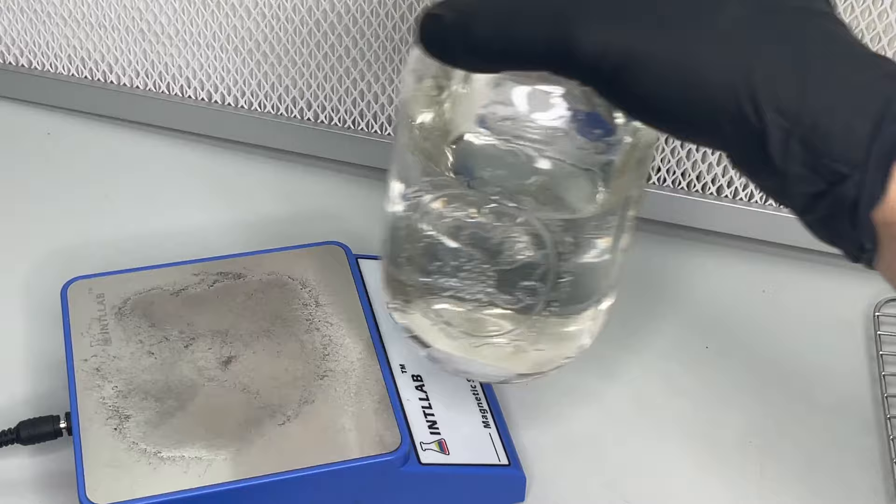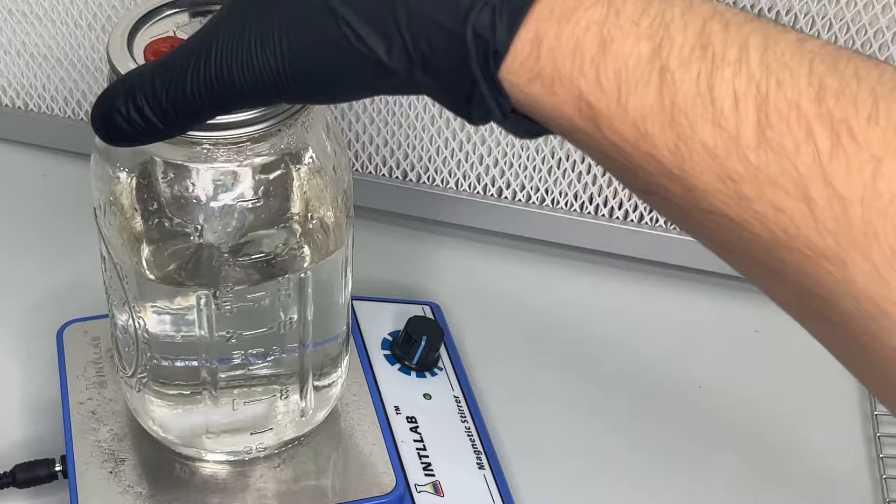After inoculating the liquid culture, you can use the magnetic stir plate one time before letting it colonize for the next week.